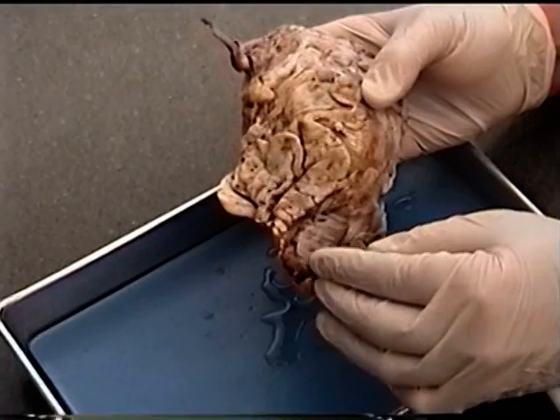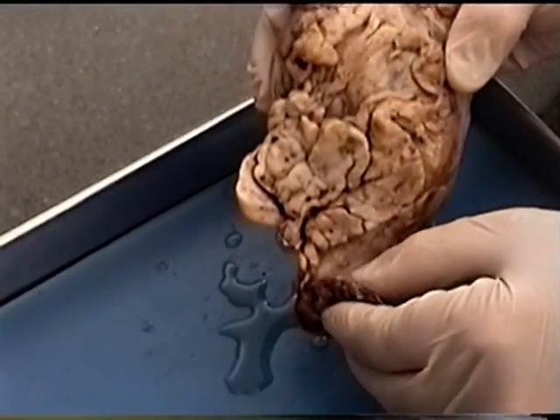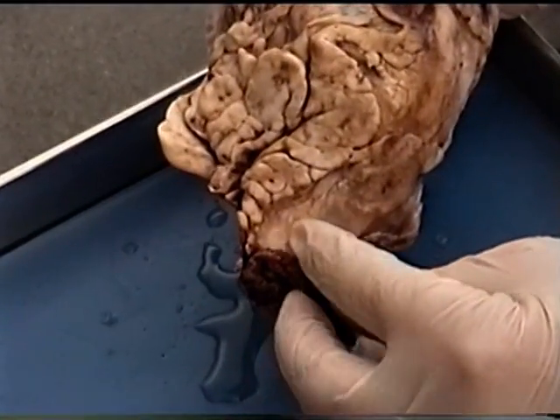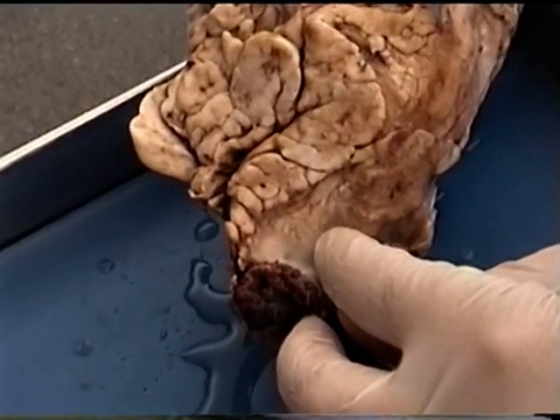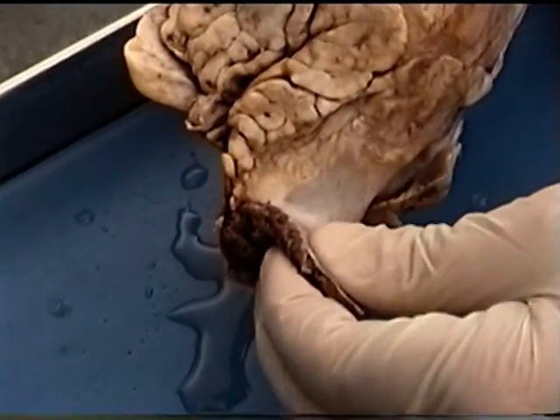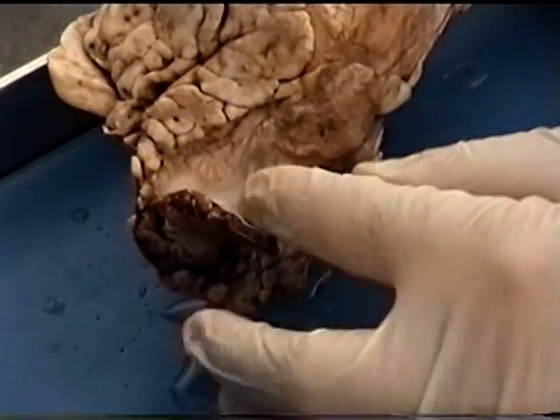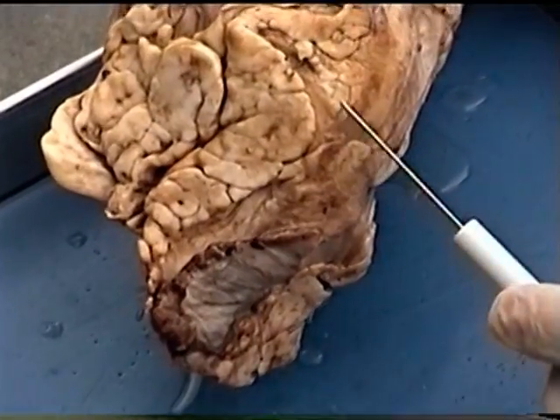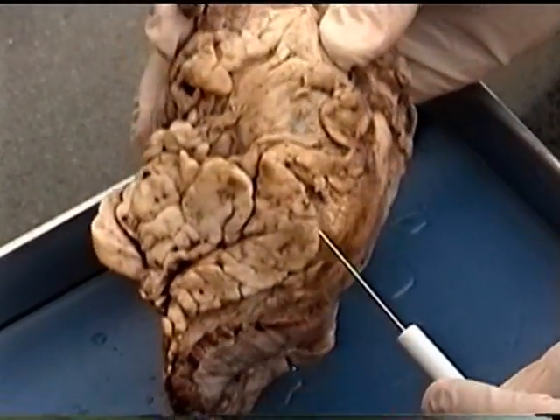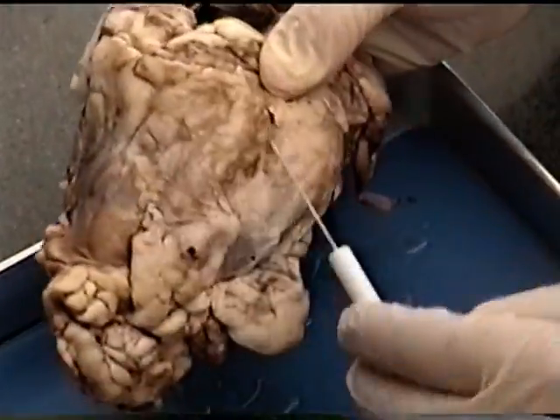cool. So this is part of the diaphragm that's still attached to the heart. And remember, the pericardium is actually attached to the diaphragm by the fibrous pericardium. What we're seeing here is the fibrous pericardium's attachment to part of the diaphragm. The outside of the pericardial sac is the fibrous pericardium. It's going to have quite a bit of adipose tissue associated with it as we're looking around here.